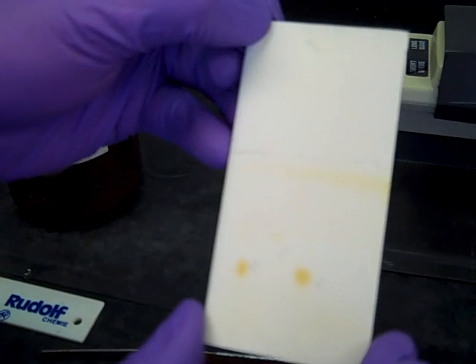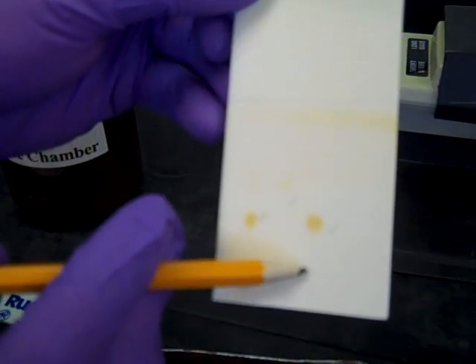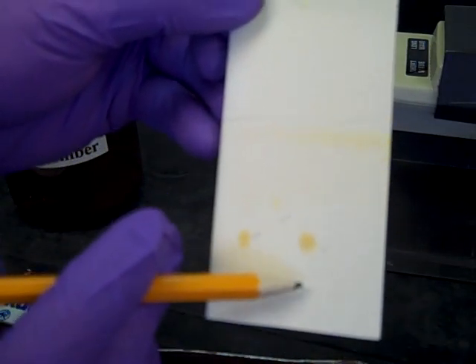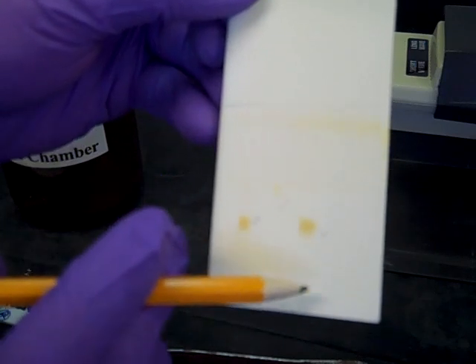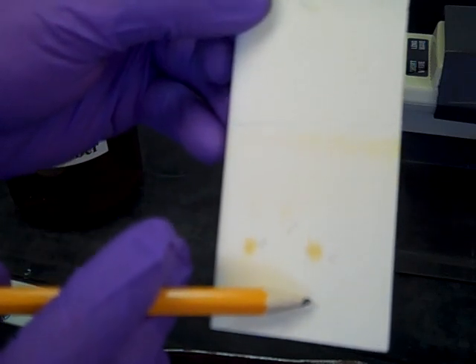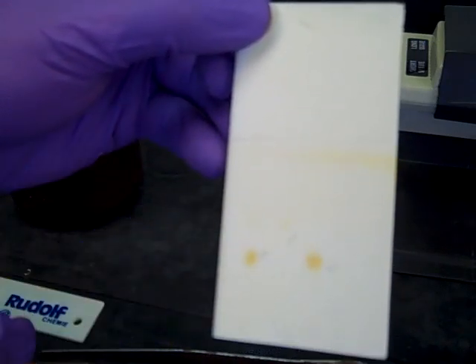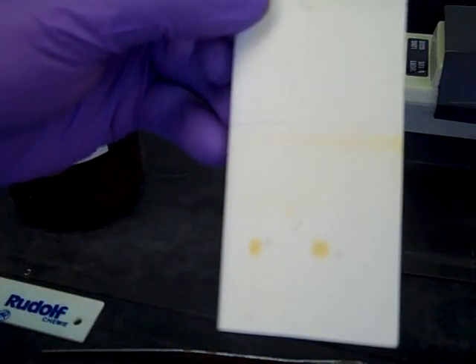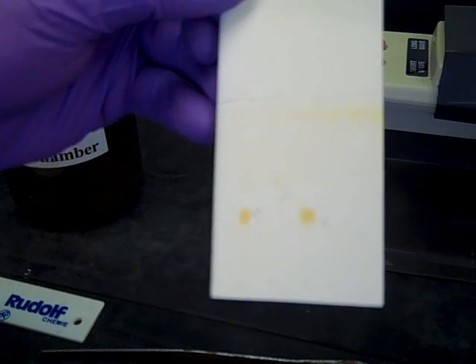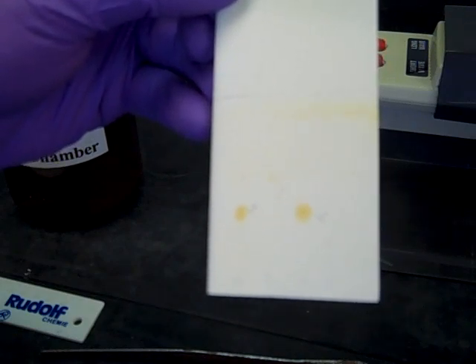We want to calculate the Rf values by getting the distance in centimeters from the baseline to the middle of the spot, divided by the distance from the baseline to the solvent front. Get all those Rf values for all the spots on your plate, and you should be ready to do your discussion and results section.